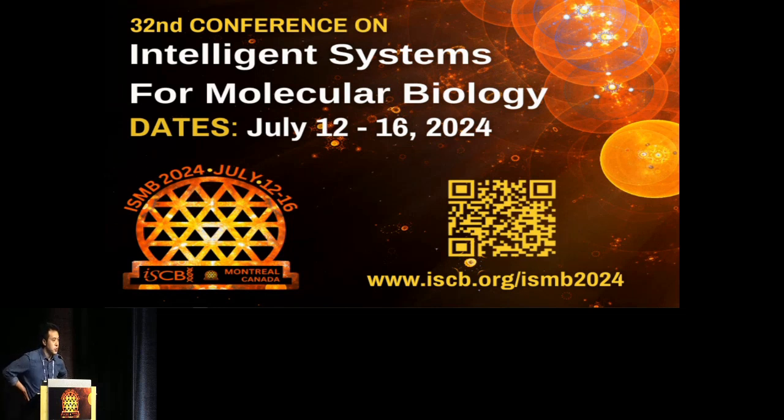So the reason why I chose more than one reason is that I talk about their coverage, 3' to 5' bias, and GC content issues. For PacBio, if you have more coverage, I assume the coverage is better, and obviously it's going to have less 3' to 5' bias because it's longer. PacBio is longer than Oxford Nanopore. So I do think it's going to solve the problem a lot.